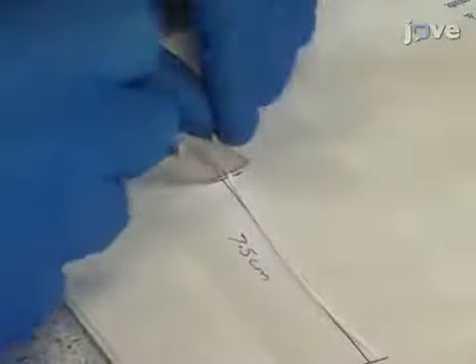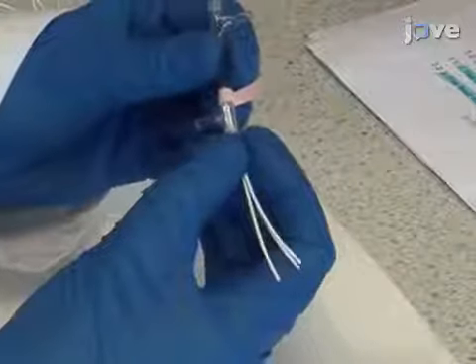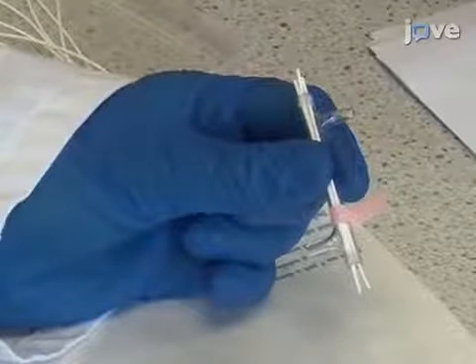Using a scalpel, cut 75mm long fibers and insert three fibers into each module, leaving approximately 7mm excess length at each end.